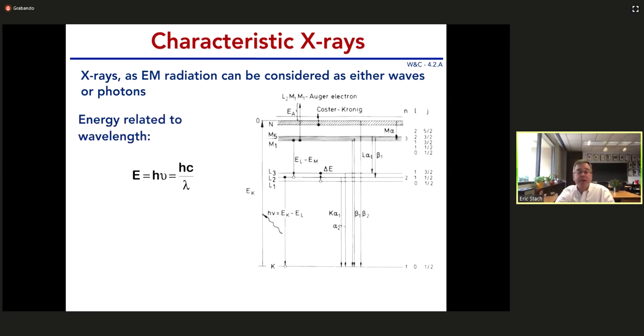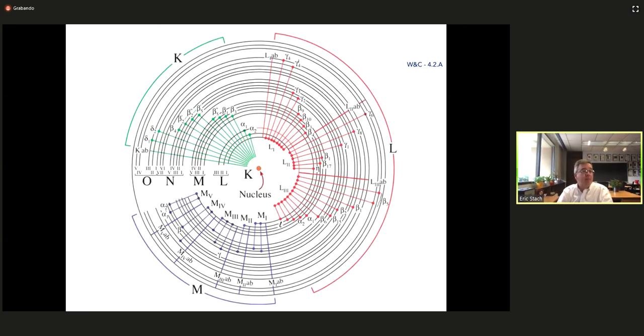In a similar fashion, it's also a delineation of the inelastic scattering event and the energy loss that you see. So there's a whole set of spectroscopic notation associated with this. And yeah, this is an ugly looking diagram, but I just showed you the K alpha 1. That came from an electron out at the L shell and down into the K shell.